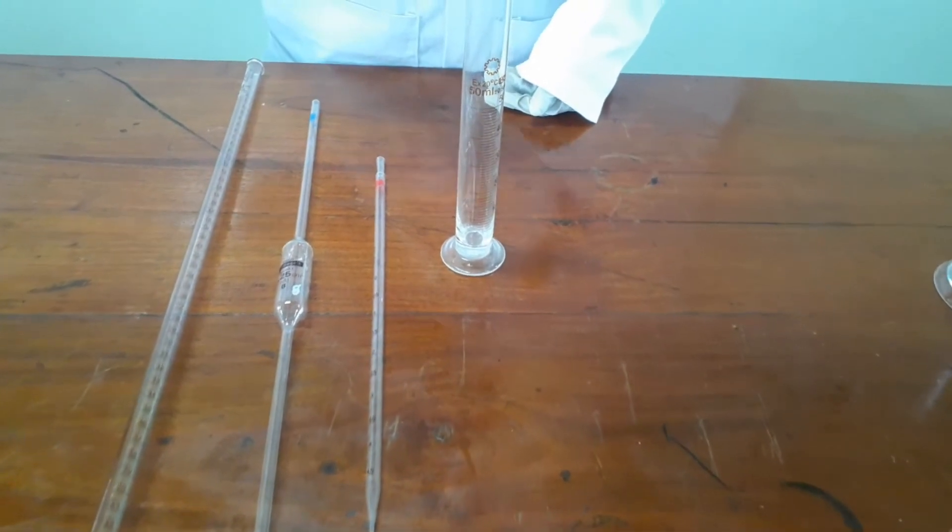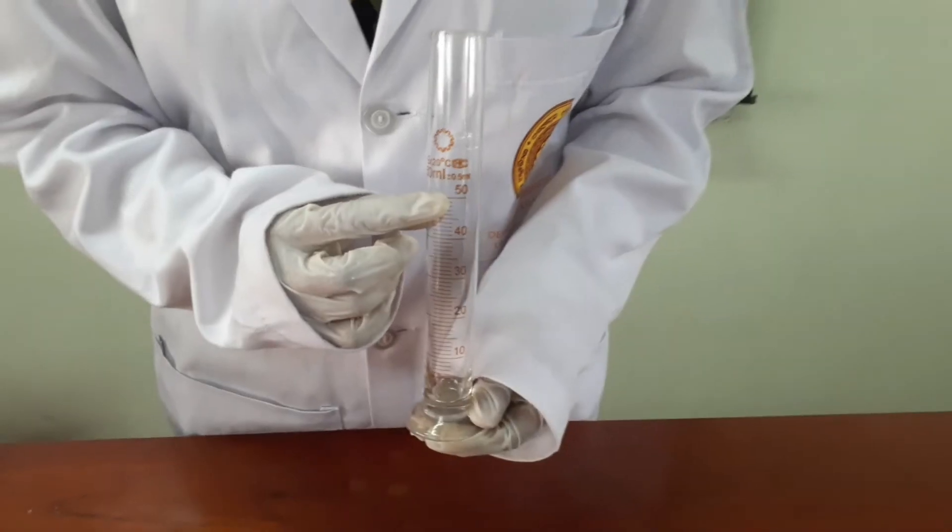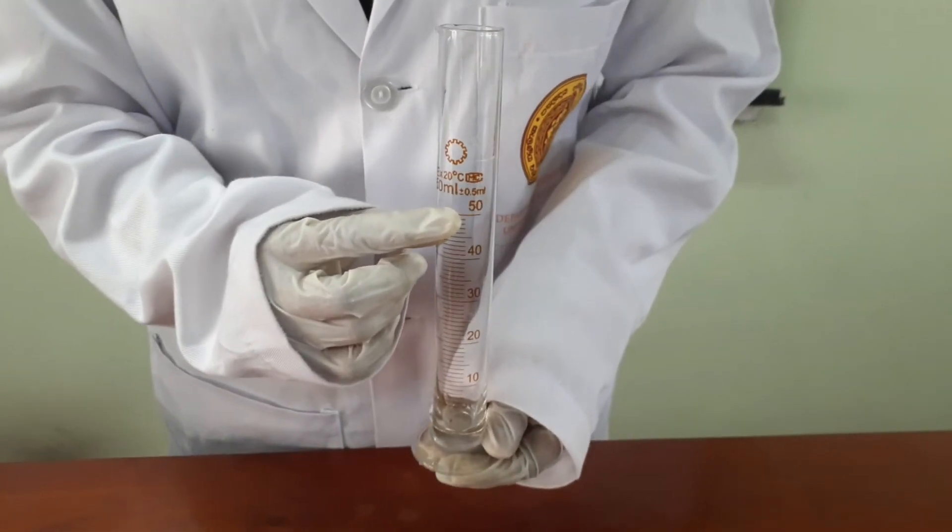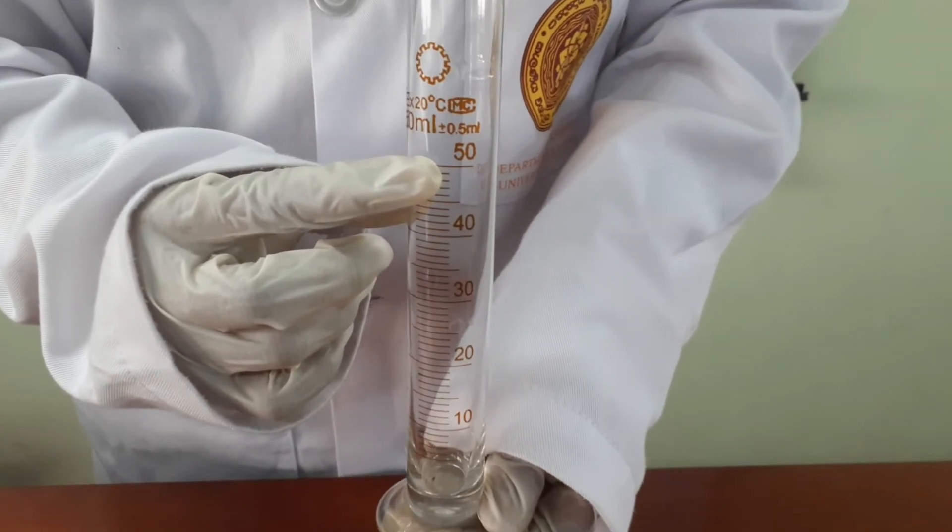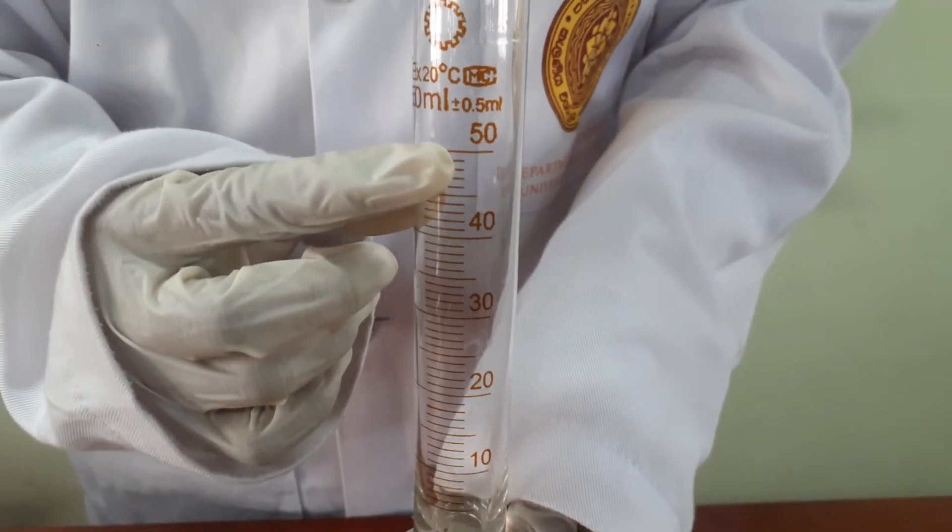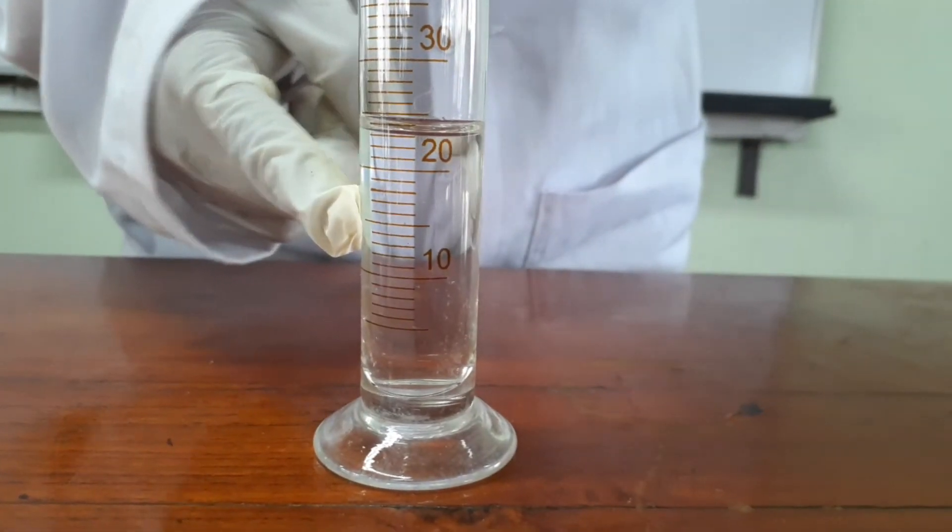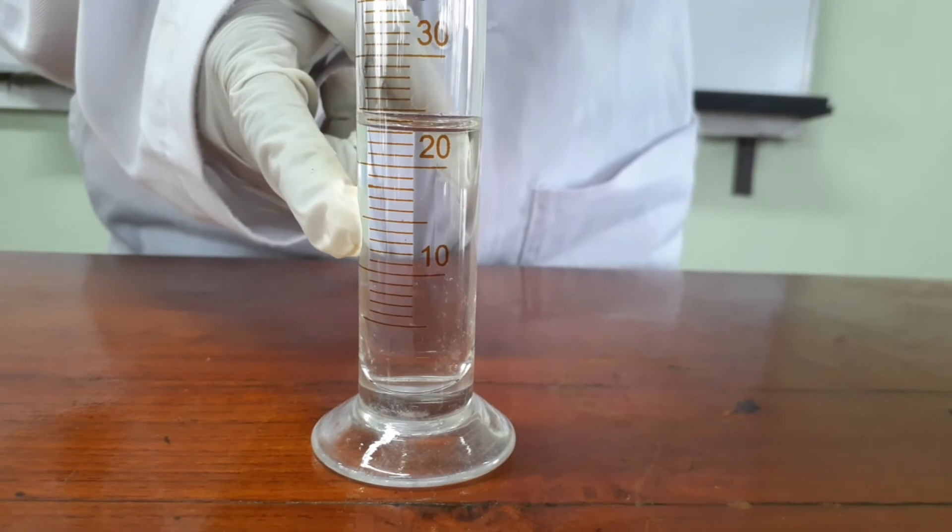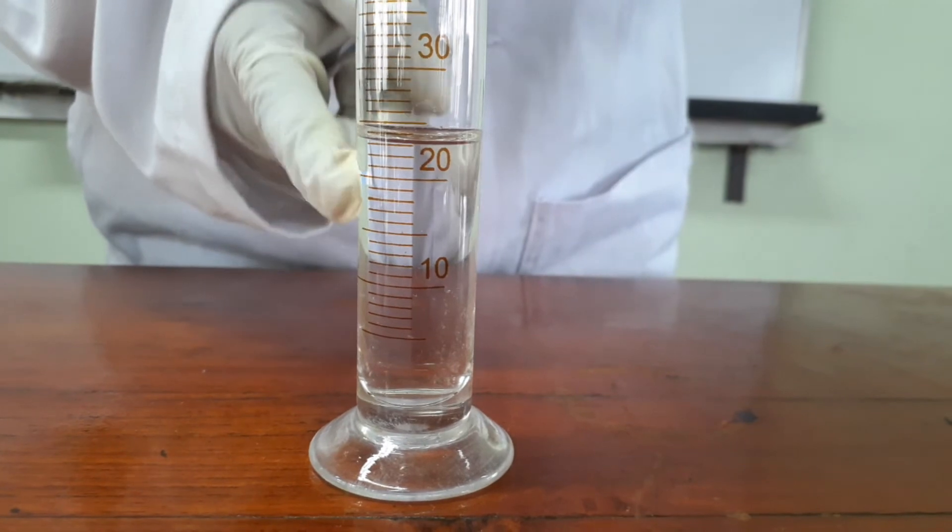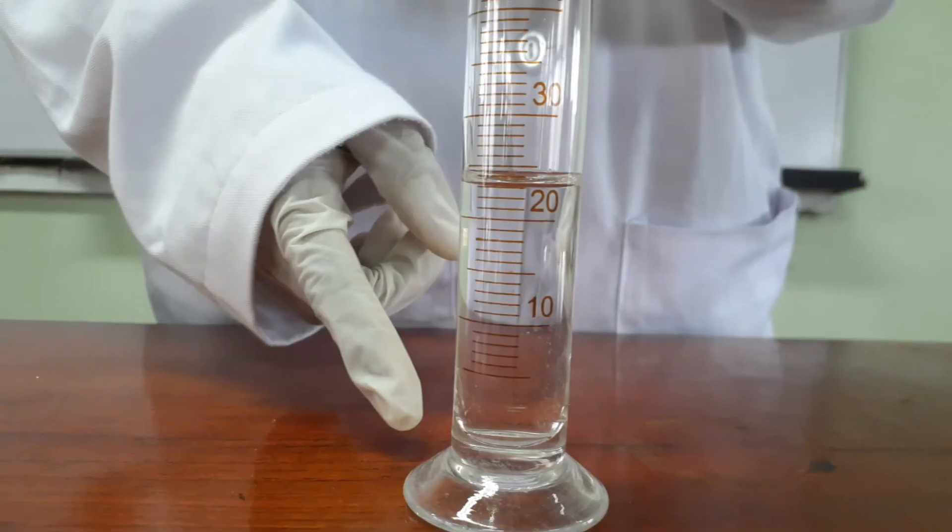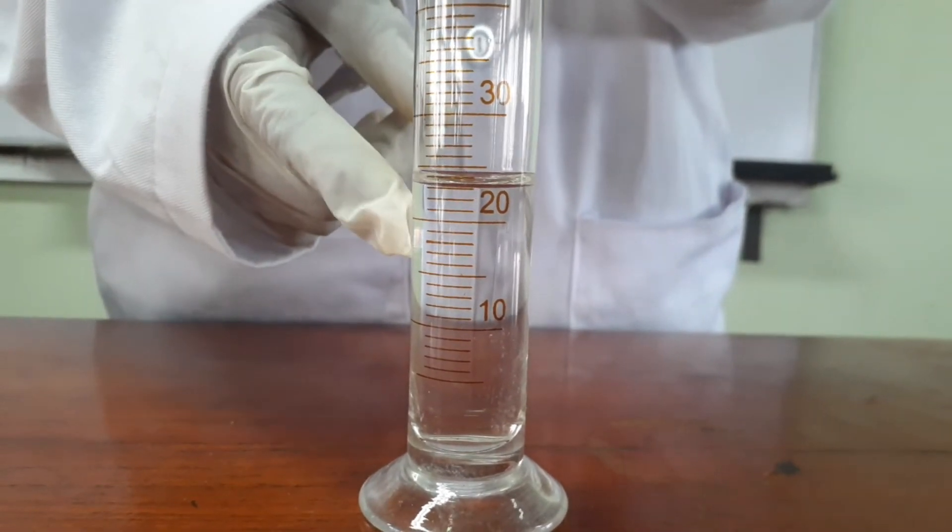Let's look at how to use this measuring cylinder. We can read up to one decimal place by using this measuring cylinder. The reading of this volume is 23 ml. As you can see, we need to read the meniscus properly in order to get the accurate result.